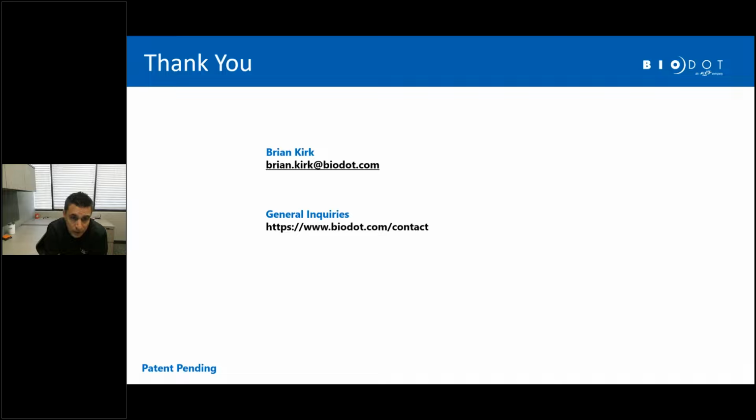Do we need the liquid nitrogen to be sterile filtered? How do we achieve that? In our applications to date, we don't require that. Most of the work to date at BioDot has been in kit formation or chemistry bead formation that doesn't require that level of sterility in the liquid nitrogen. I don't know off the top of my head if that's actually a need based on the temperature. So we've been typically working with a standard liquid nitrogen source. So we have Airgas bring in liquid nitrogen.